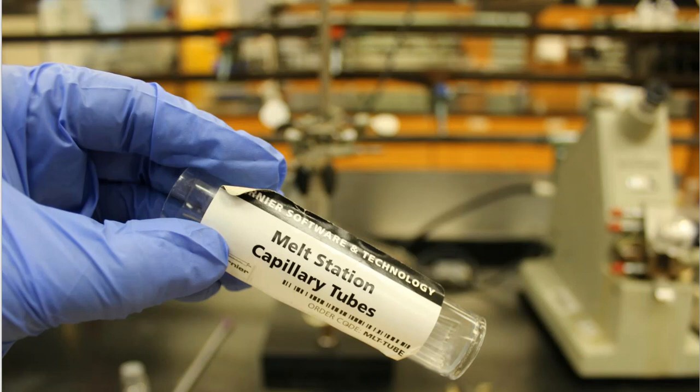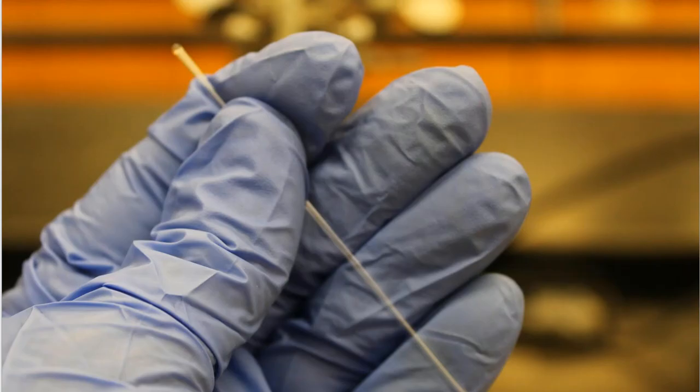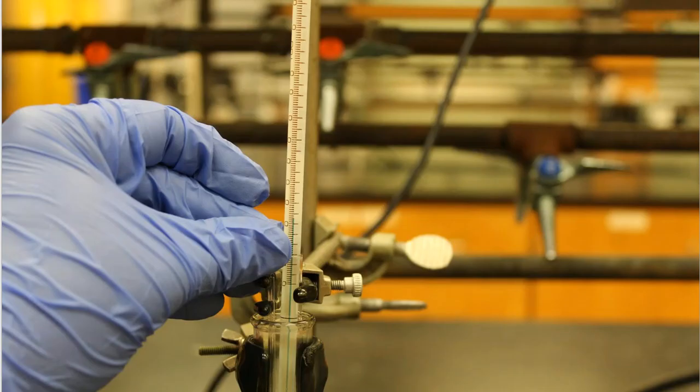All right. Next, I'll need a thermometer. It's somewhat out of focus, but I do need a thermometer so that I can record the temperature at which this substance boils, of course, right? So I'll pull a thermometer out of a drawer, and then I'll take one of the capillary tubes out. Notice up here at the very top, this is where my curved closed end is. That's the way that I'm holding it. And then down here at the bottom, you can't see it in the picture, but that will be my open end. And I need to put that capillary tube in the test tube.